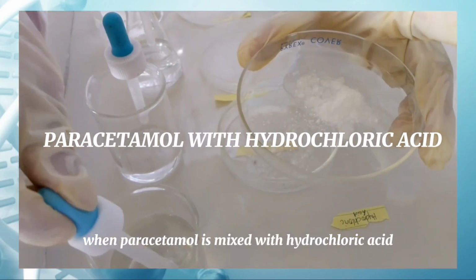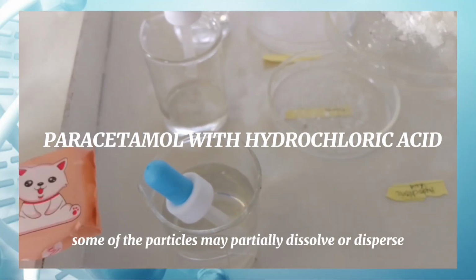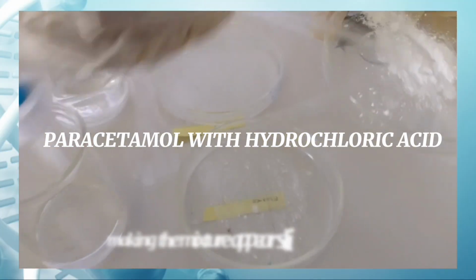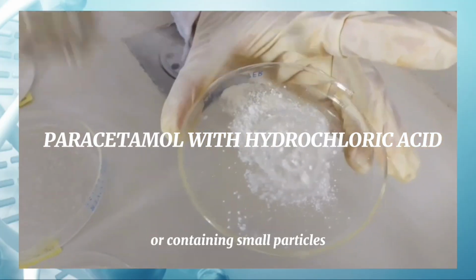When paracetamol is mixed with hydrochloric acid, some of the particles partially dissolve or disperse, making the mixture appear slightly cloudy or containing small particles.